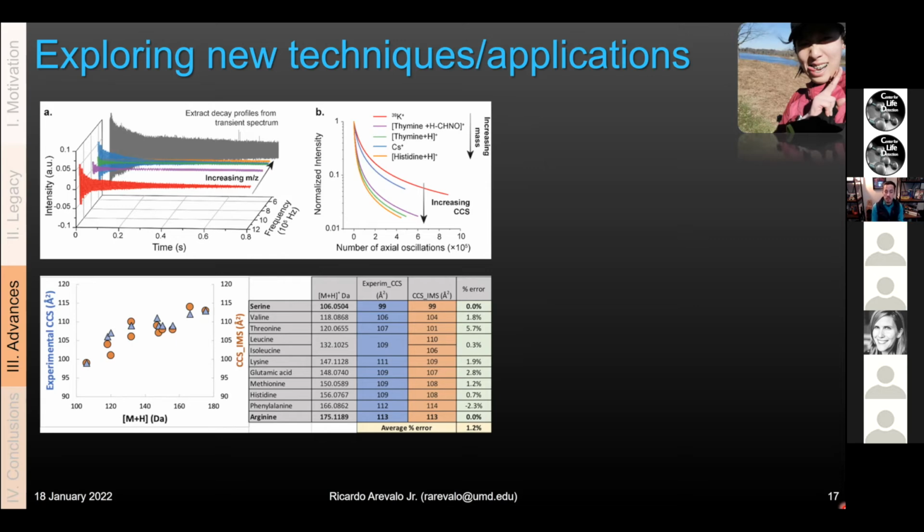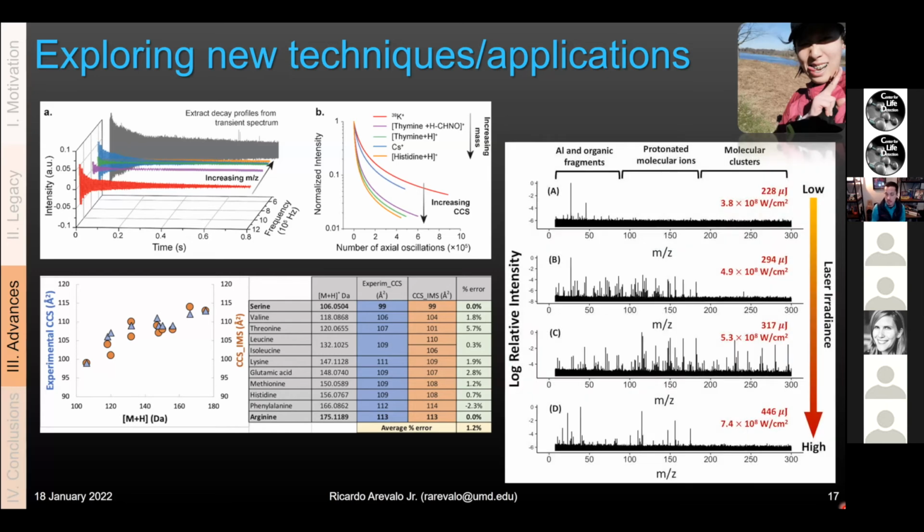And so Grace and others have been trying to understand, it's kind of like an ion mobility experiment. Can you derive a corroborative measure of molecular identity? And then on top of that, could you do something even more exciting, like distinguish structural isomers that might have different collision cross sections because of the way the atoms are arranged in that compound? And then on top of that, in-source decay is something that we're trying to empirically show, rather than me just telling you that it's really cool. We're trying to crank up the laser on purpose, intentionally break down the organics in there, and look at the fragments and get that de facto MS-MS spectrum.